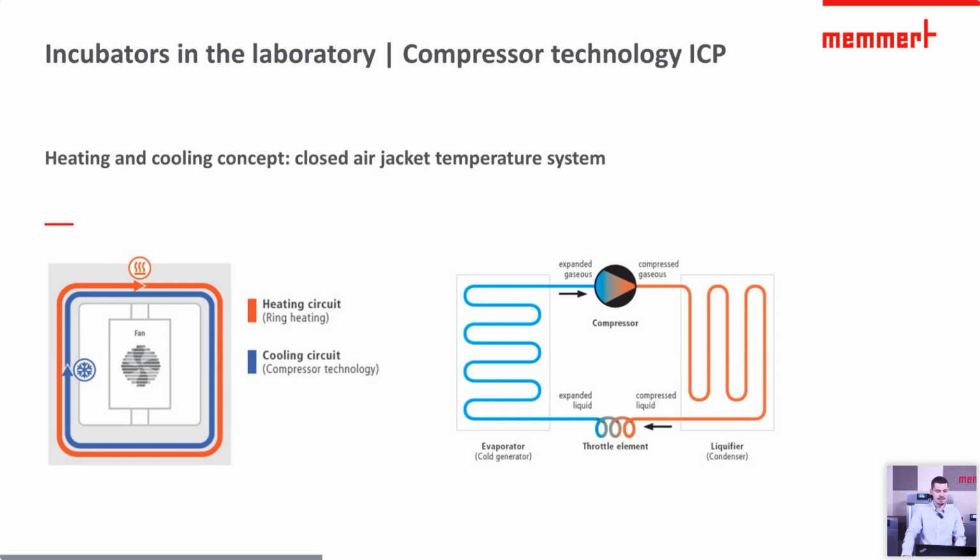Compressor technology has the advantage over Peltier technology of higher thermal compensation, especially if the doors open frequently and the sample itself emits additional heat. So the compressor is particularly suitable for applications in which heat is released into the interior.